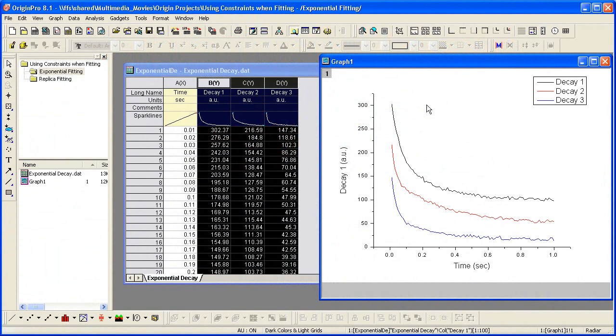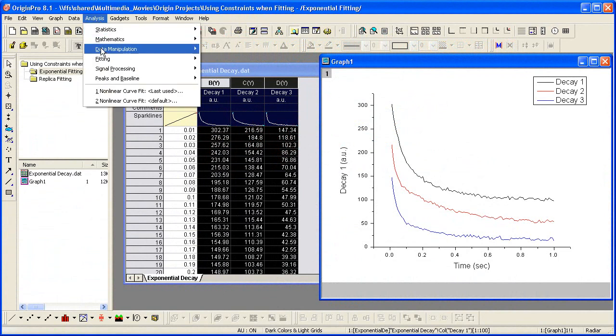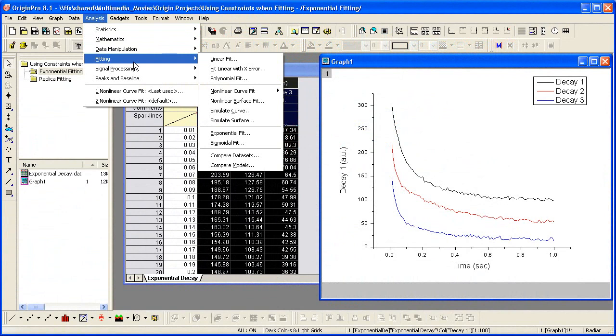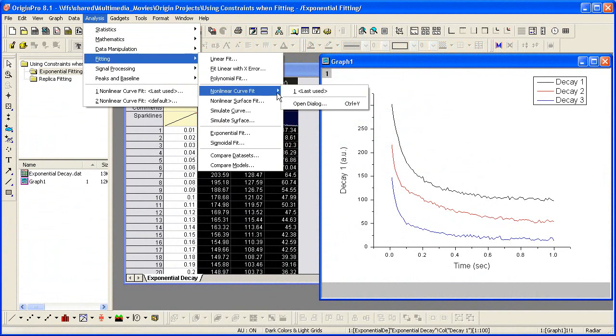Here I start with a graph with three exponential decaying curves. To fit the data, I select Analysis Fitting Non-Linear Curve Fit.